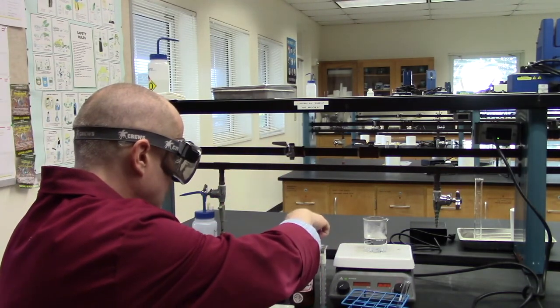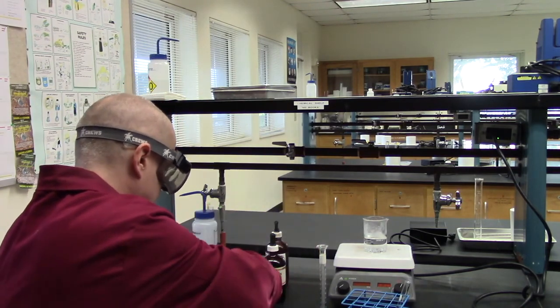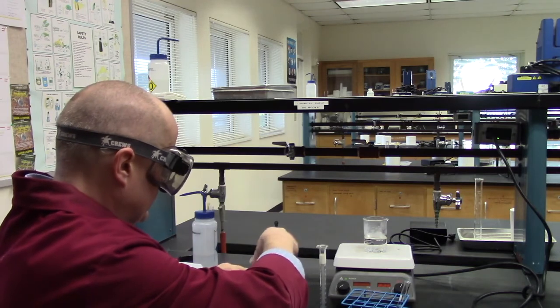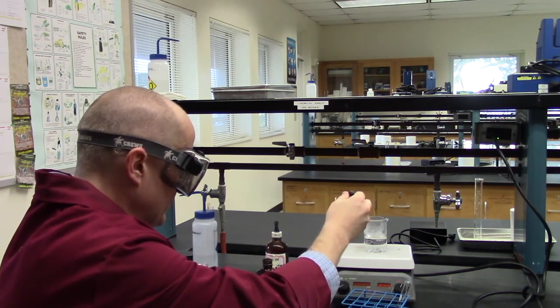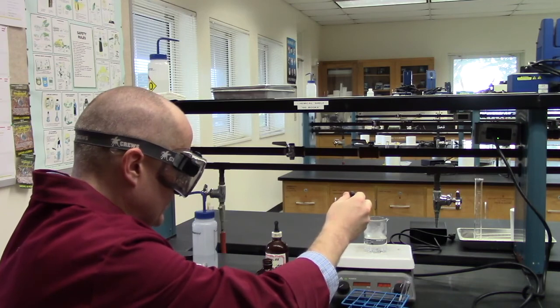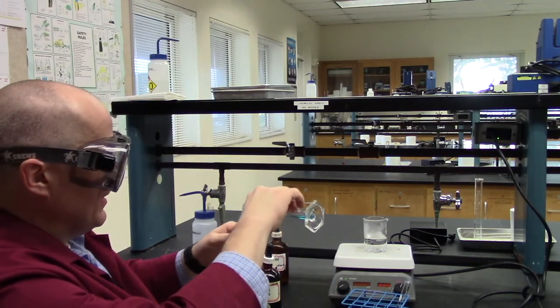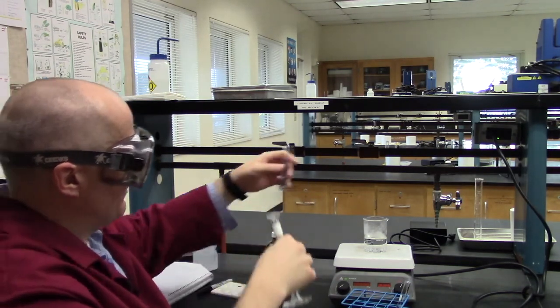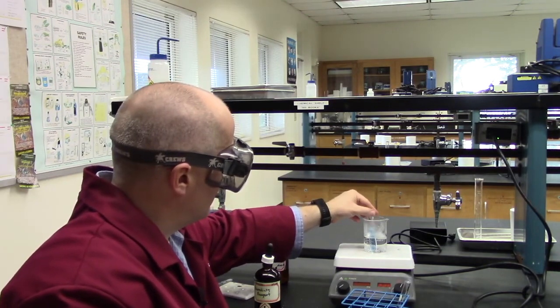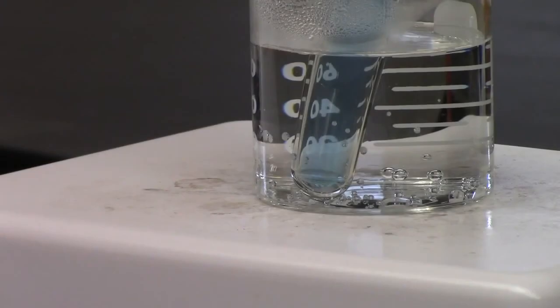Let me get rid of this bottle here. Get that out of the way too. About a mil. It doesn't have to be too accurate, but about a mil. All right, so put a milliliter in here. And put that back in the water. The water is nice and hot, so this shouldn't take very long. I'll make sure my other camera's picking that up. All right, very good. That's about a mil.